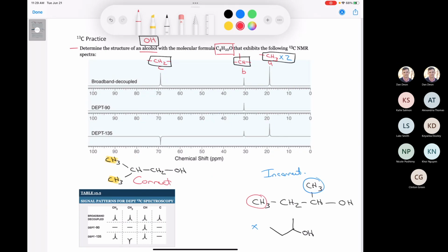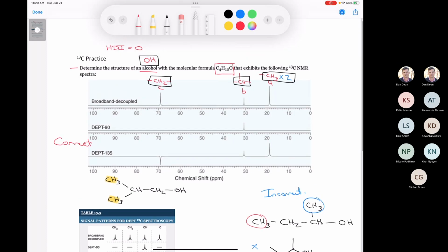Now what we want to do is annotate the spectrum. So we want to identify all of the carbons in here. Notice, when we're annotating a spectrum, we always start on the right-hand side and we go towards the left-hand side. And every signal we label with a letter of the alphabet, always starting with A. So we have A, B, and C. Now we go over to our structure. We write A next to, I'll use a different color.